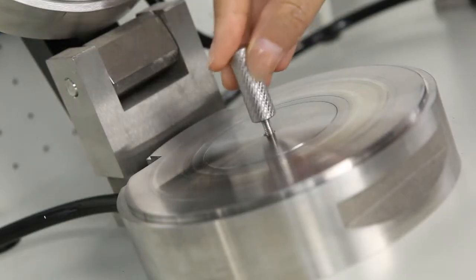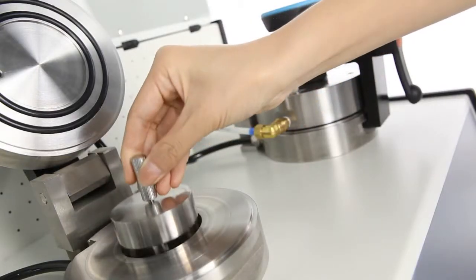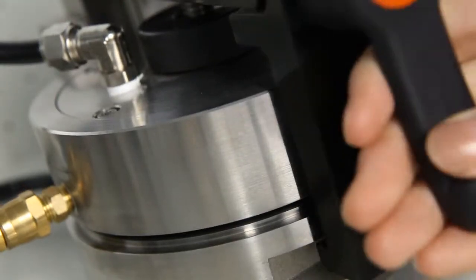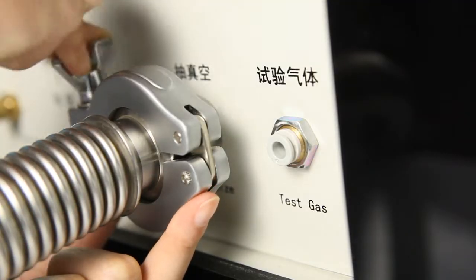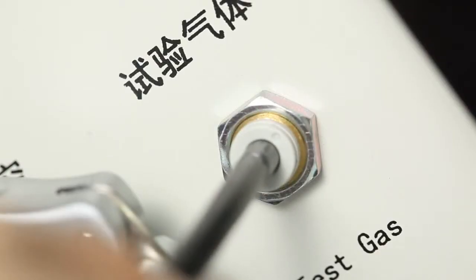It can also perform gas permeability test of low barrier materials by extending the volume of the lower chamber and carry out the GTR test of hazardous gas through customization.